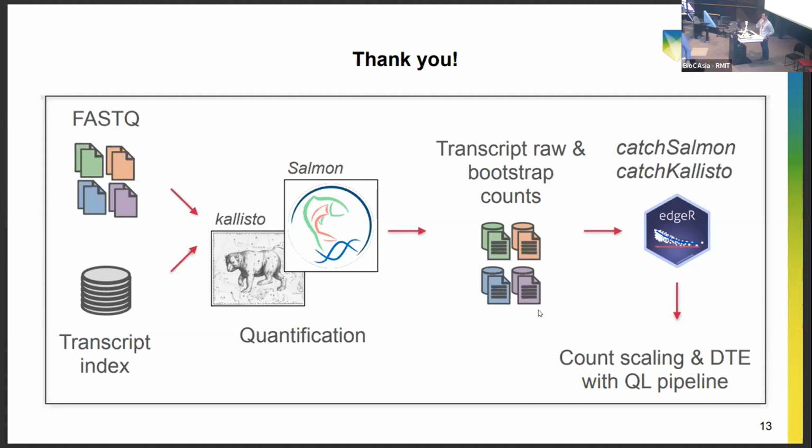So I imagine when you apply this method and you rank things in terms of what's most differentially expressed versus not, if you apply it to raw, you're going to get some result. But then when you apply this method where you start moderating the variances, the ranking of those genes will start changing. I'm just wondering if the genes that have only one transcript end up ranking higher than those that have multiple. And if this is actually what we want to be happening, even though it's statistically correct, if it's actually what a biologist might want.